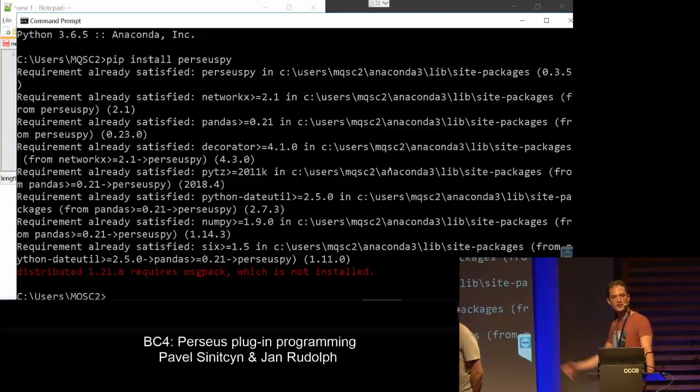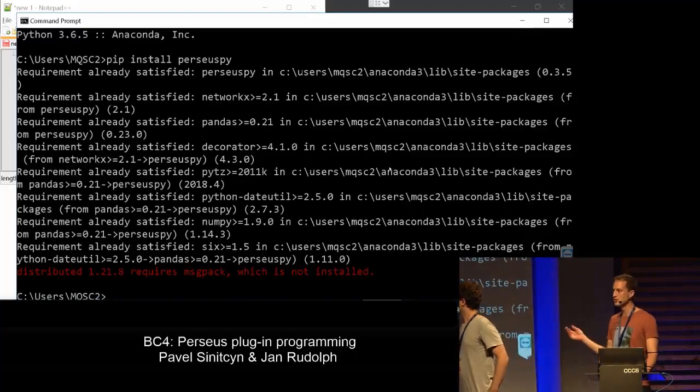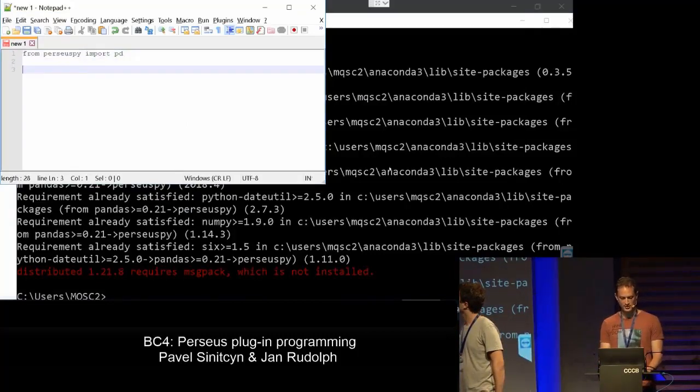This would be the command. But for anyone that's done Python, this should be quite straightforward. I'm sorry if I skip over some steps, but you have the reference on GitHub. There's a really step-by-step guide, and all the code is there.